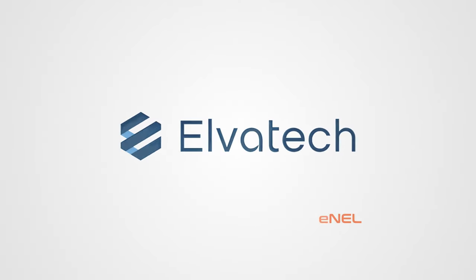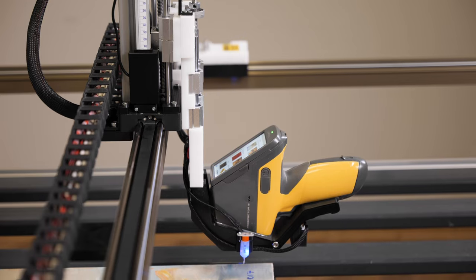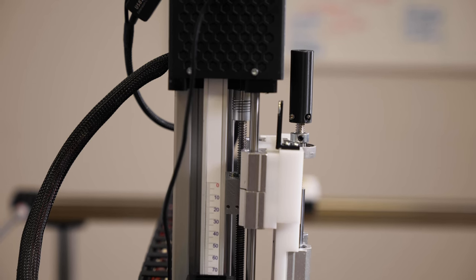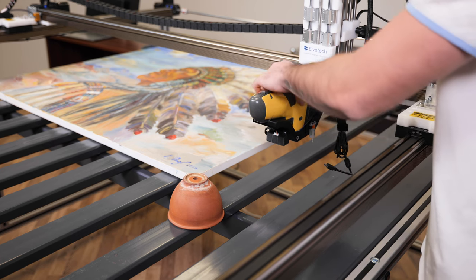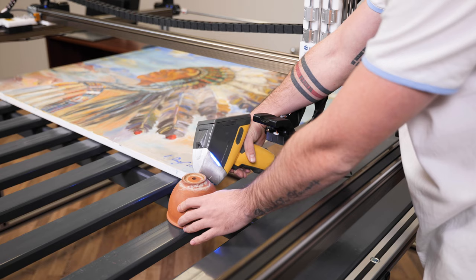Elvox Art is not just an analyzer — it is an entire system specially designed for art experts and restorers, providing the highest accuracy and depth of analysis. What makes Elvox Art special is that it's not only a complete analytical suite for detailed desktop analysis of art objects, but also the system offers the operator flexibility of use thanks to the Prospector 3 handheld analyzer, which can be easily removed from the holder and used as a standalone handheld analyzer, making this suite ideal for a wide range of art and ancient artefacts analysis applications.